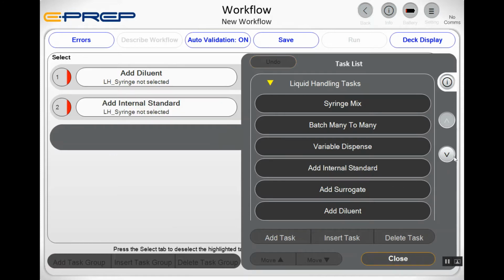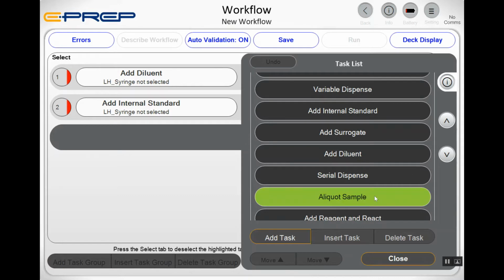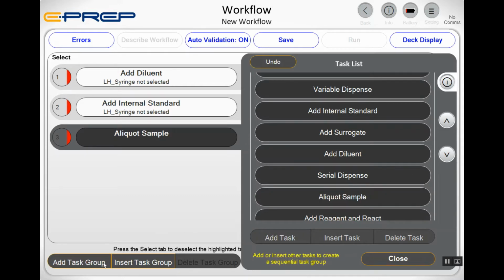We shall put the original samples in a rack and then transfer an aliquot to a 2 ml vial. The tasks are carried out specifically in this order for efficiency, so the internal standard solution will be added to each of the vials and the needle will be dipped below the level of the diluent. Because this is done before the sample is added to each of the vials, the syringe will not require washing between internal standard dispenses.